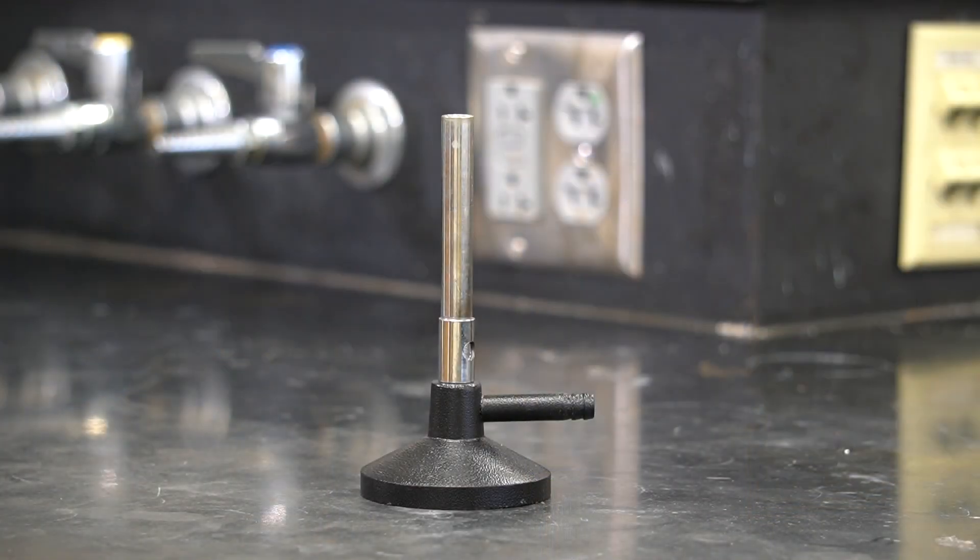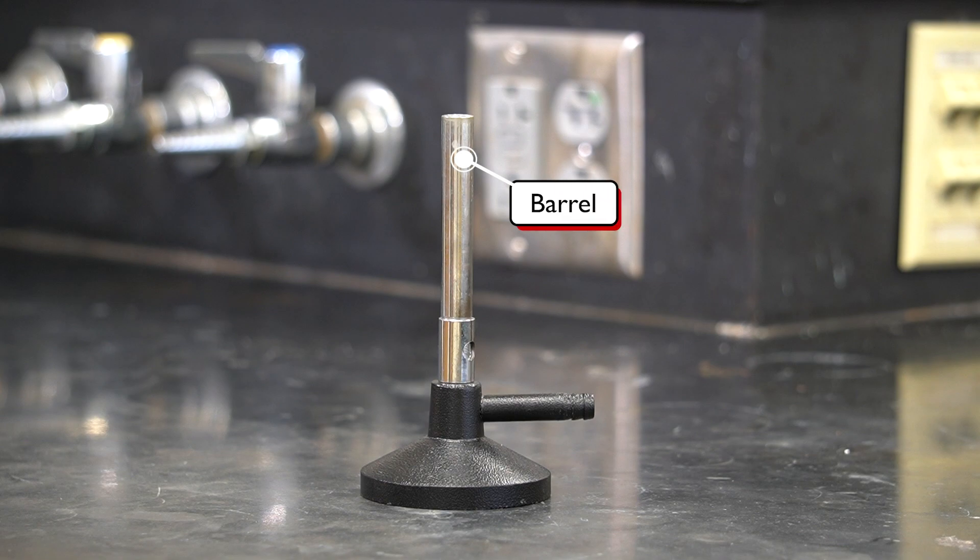Before we start assembling, let's first take a closer look at the Bunsen burner. Starting from the top, this tubing is called the barrel. This is where the flame will be produced.